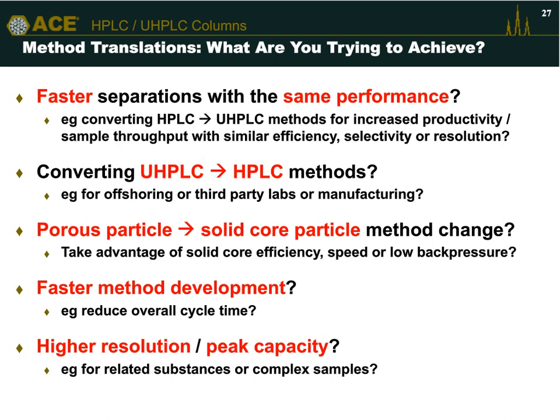What are you trying to achieve with your method translations? Do you want the same separation, you just want it faster? Do you want to convert from HPLC to UHPLC, but maintain the quality of the separation in terms of efficiency, selectivity, or resolution?